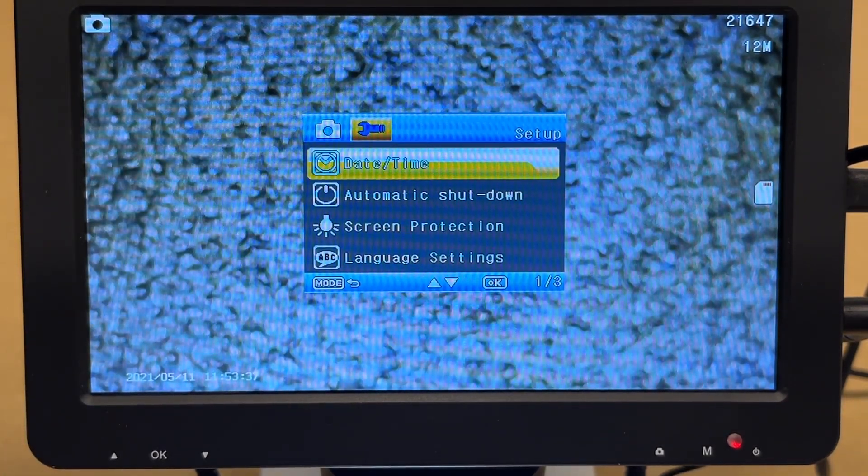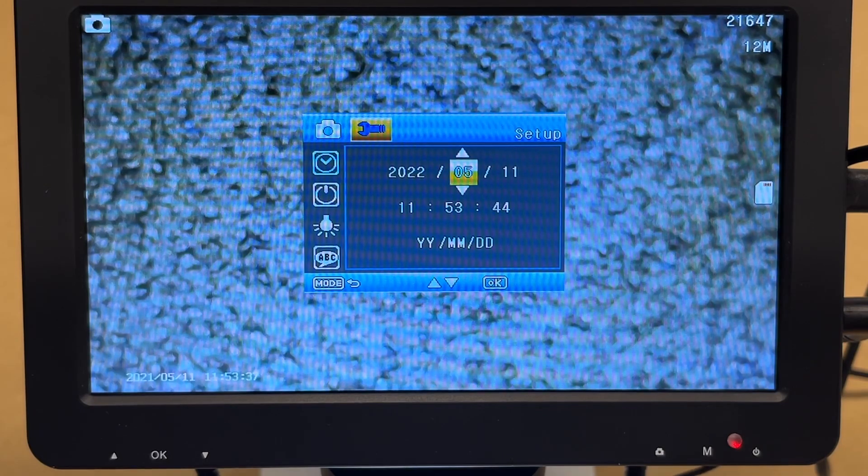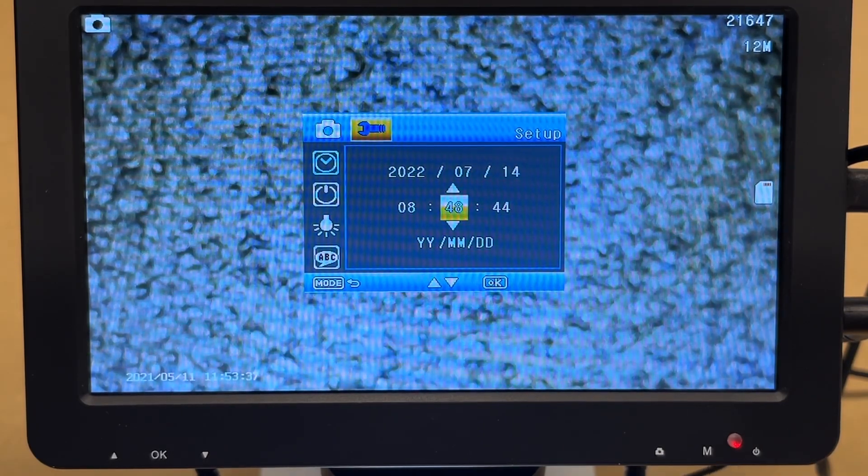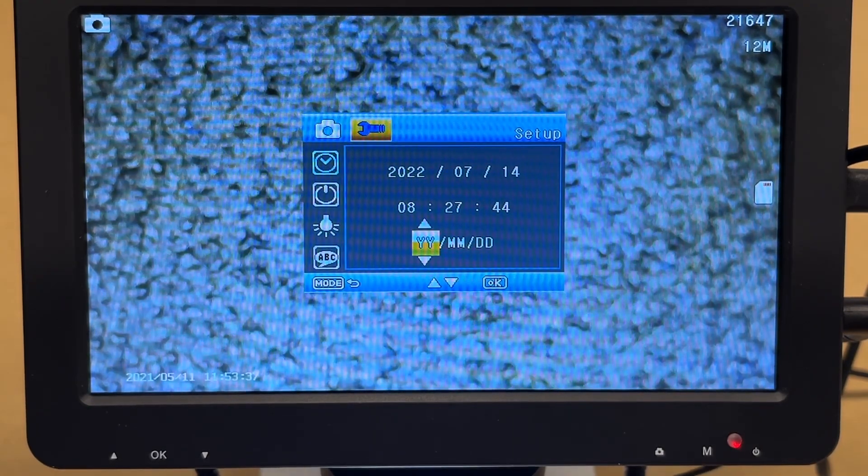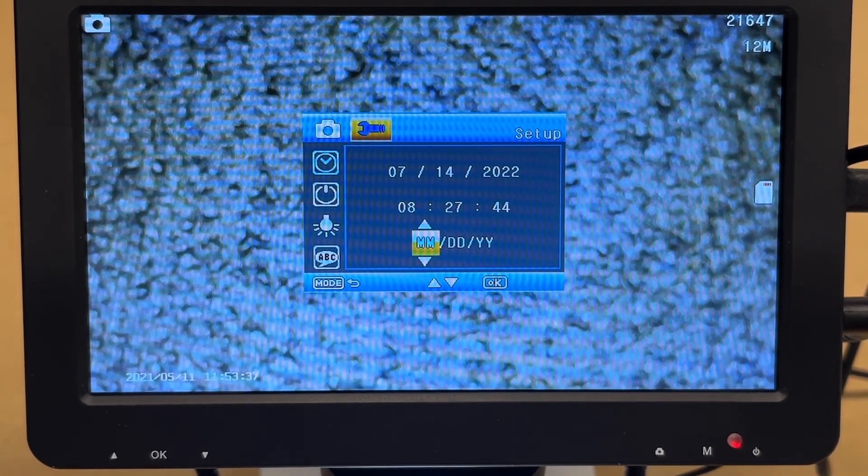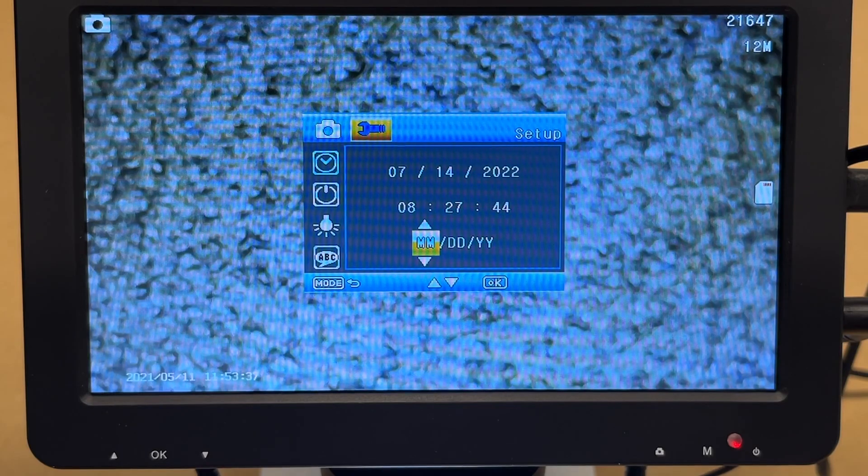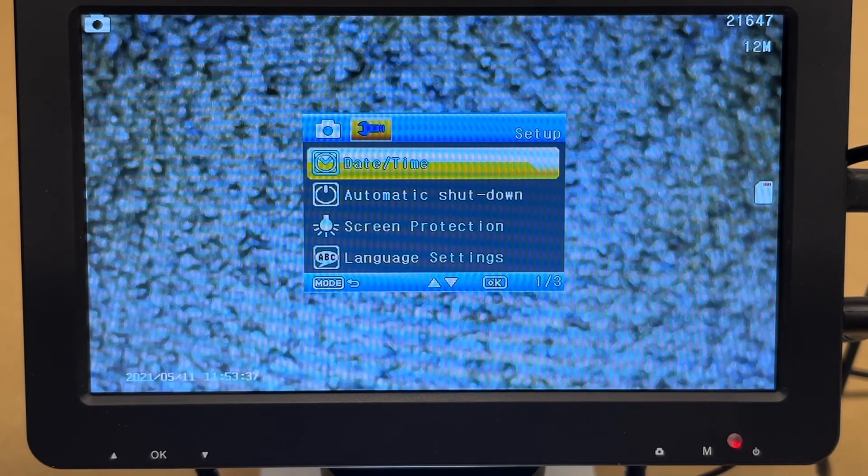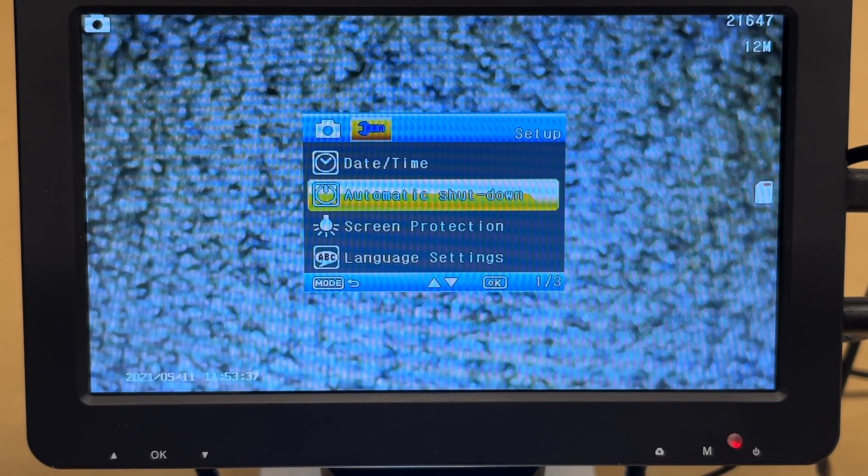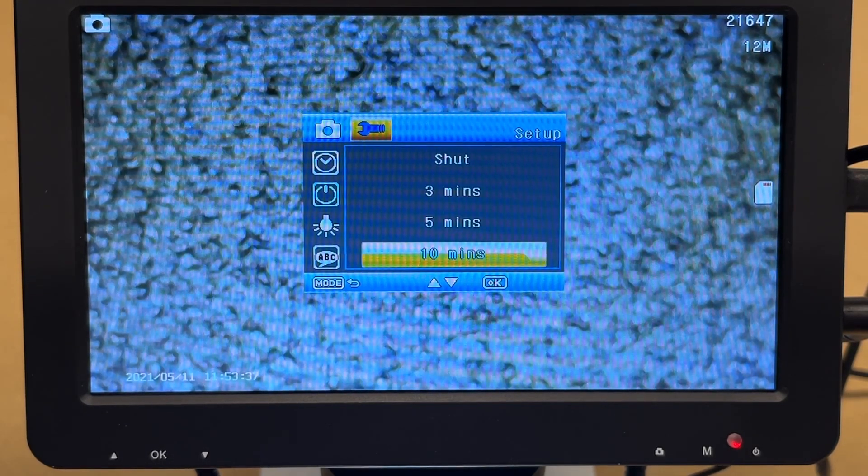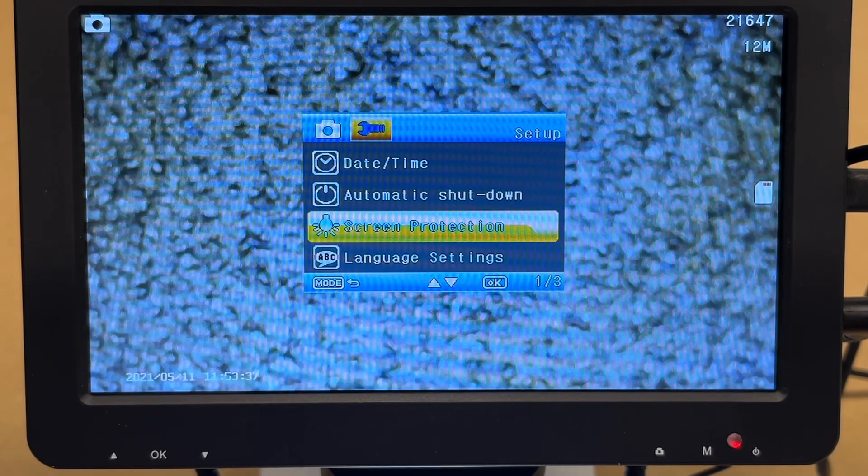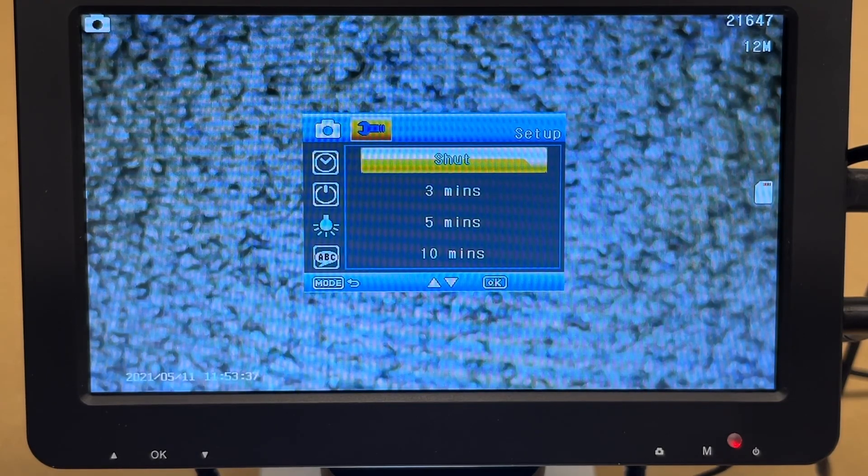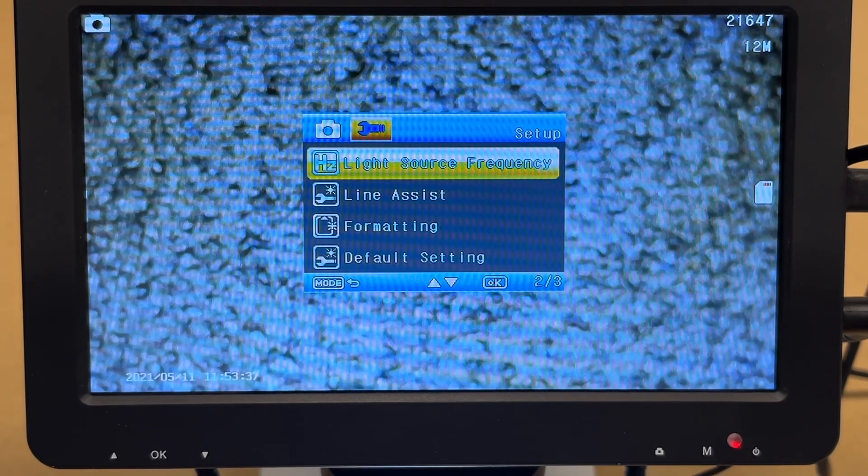If I hit M again, I'll go to this wrench here. And then we can set the date and time. So I'll do that real quick. And we have the date format. So I'll do month to year. So I'll hit mode to get out of this. Automatic shutdown: 3, 5, or 10 minutes. Screen protection: 3, 5, and 10 minutes. We have language setting.